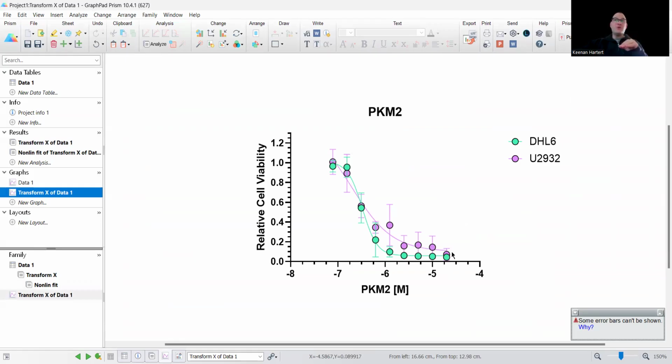But technically, if you don't tell it, it's just going to take where's the 50% inhibition in the curve itself. So let's say that this value right here was actually closer to 80 and the max value only killed like 20%, were still alive. It would actually only get the middle of that, or let's say this was 10. So it would be uneven. It wouldn't actually be the 50% that we want right there, for example, right?